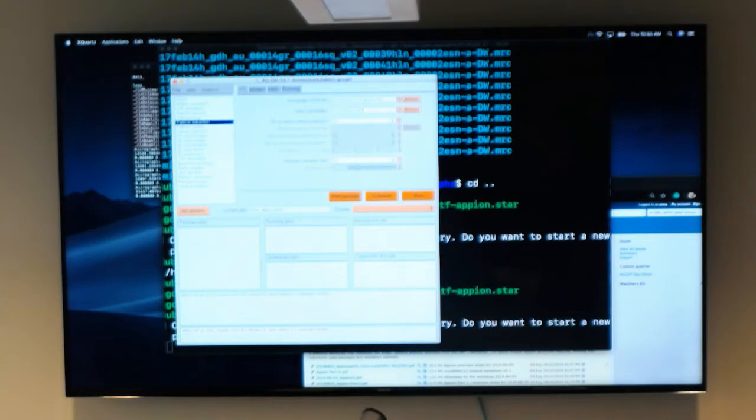So now you know it's just my naming structure. That's why I had you set up the environment as such. You don't have to necessarily do this. You can have your own structure, and you can change the star file as that. But I put the import coordinates in a folder called micrographs, and then the extension for the particle pixel.box. The rest of the tutorial you can start working on your own.